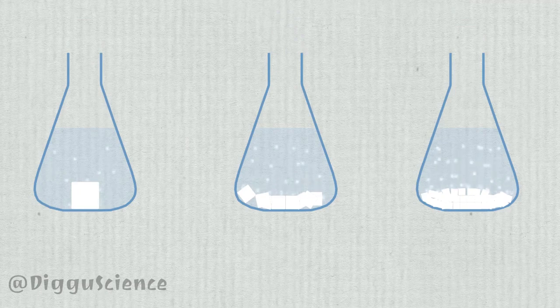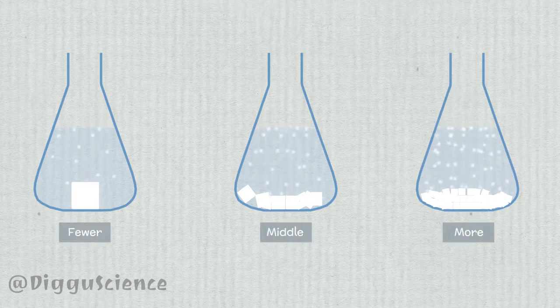It turns out, the number of bubbles that appear every second is not the same. Cubes with a smaller size apparently produce more bubbles. Conversely, the largest cubes produce fewer bubbles. How to explain this?